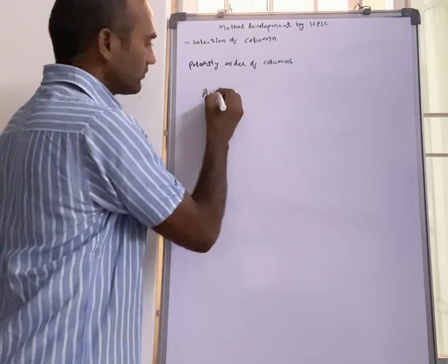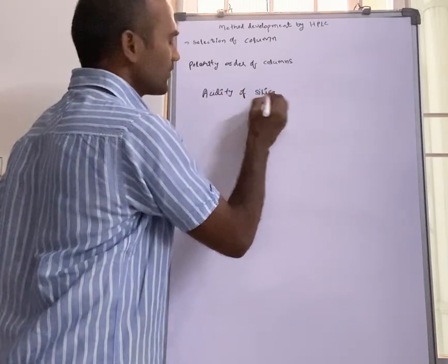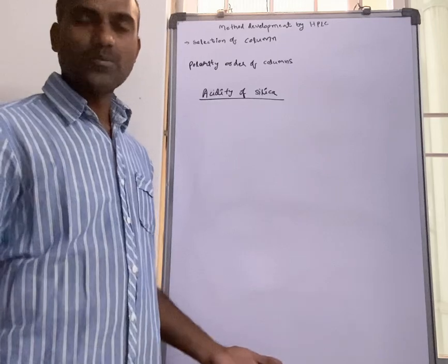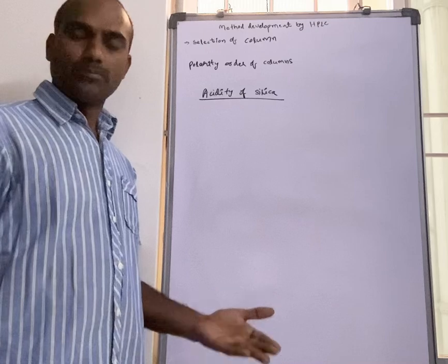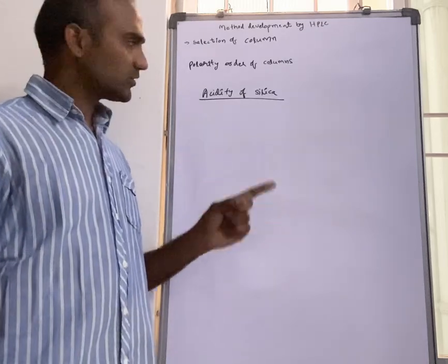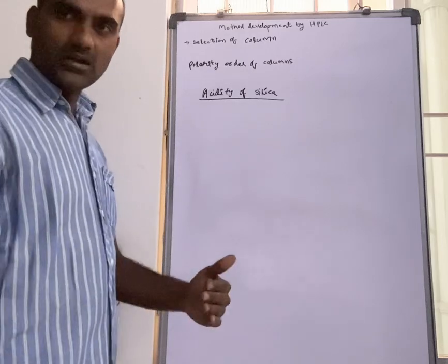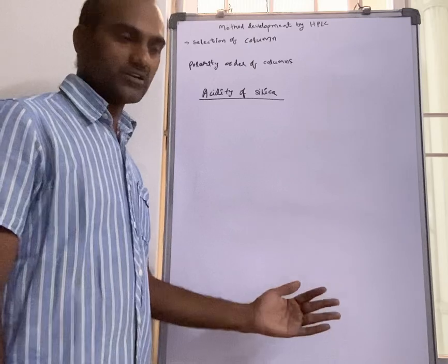Acidity of silica. How will it influence? We already discussed in the selection of pH. Acidity or basicity plays a very crucial role in the peak shape for the molecules. So selection of pH is very important, I told already. So this acidity of the silica will influence the separation. Different brands may have slight changes in silica acidity.